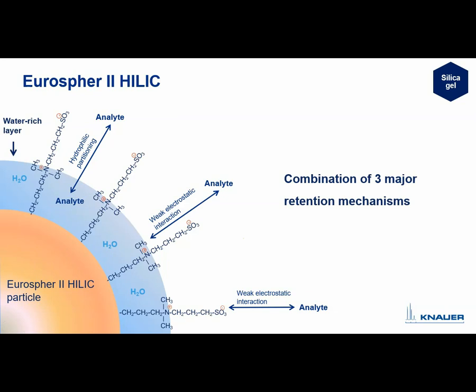So I hope now you got an idea of what normal phase and reversed phase particles look like, and also what HILIC means.